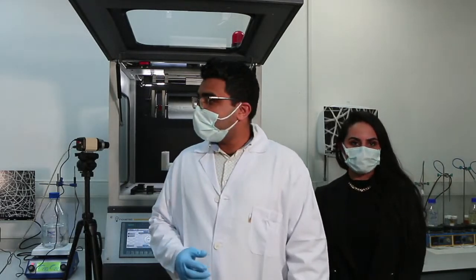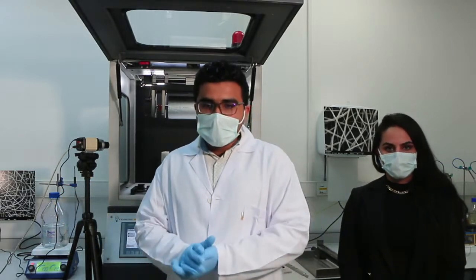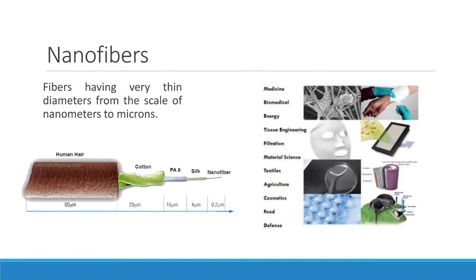All right. So my colleague Bushra explained the specifics of what we're going to do. If we can get a presentation running, we can talk about the rudimentary topics of electrospinning, just to give you an introduction. Afterwards, we will be showing you the actual thing with our laboratory device. If you can see the slide, Intro to Inovenso, it is just to give you an idea of the type of science that we are doing in our laboratory.